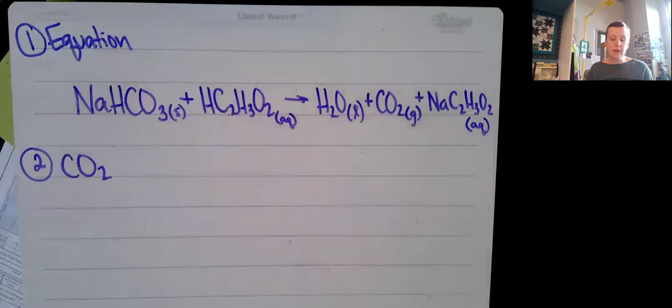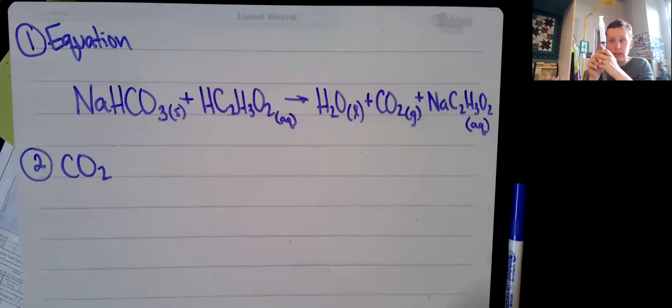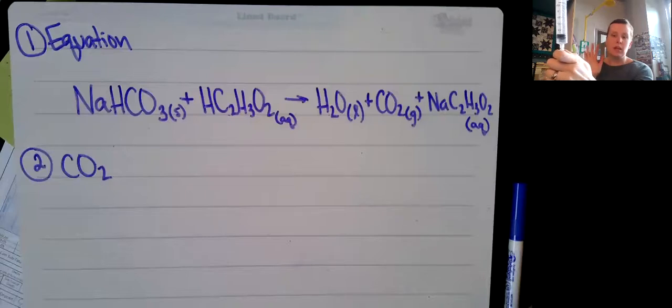Number 3, we will be using different concentrations of acetic acid for each of the 3 reactions. Why is it important that we use the same volume of acetic acid in each reaction? Remember, I'm going to start off with 5 milliliters of the acid, and it might be more concentrated, so there's more moles there, but it's important that we start with just 5 milliliters each time. And part of that is when I push that into the test tube, even if there was no chemical reaction, 5 milliliters of gas would be displaced in the test tube. And if you look, it's coming back up to 5 milliliters without me even touching it, okay?